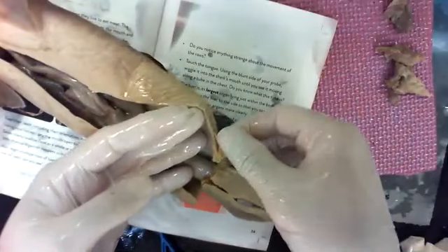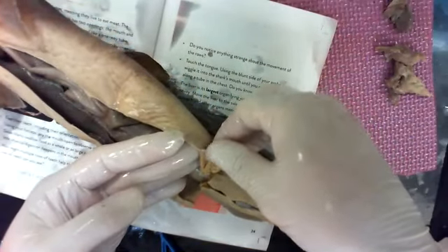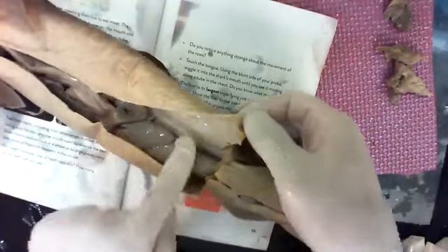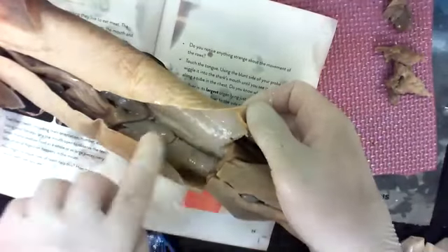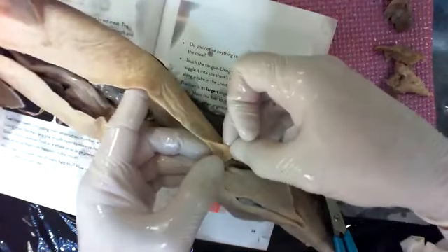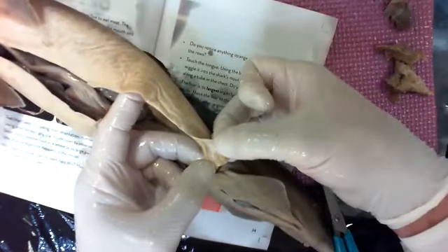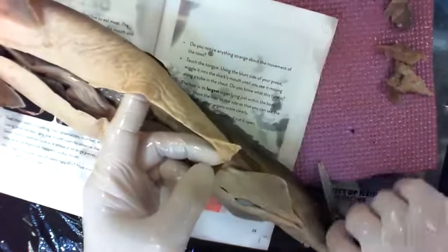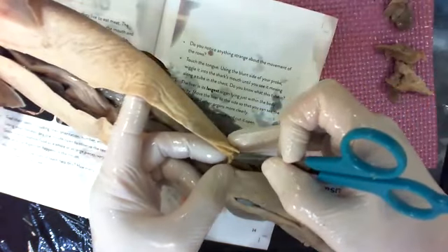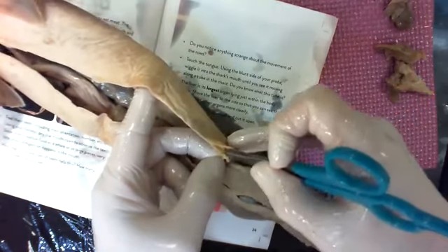When I open this up, it's kind of cool. I can see the layers. Here's the skin. Here are the layers of abdominal muscles, just like we have. The sac, the shiny part, is the sac that goes around all the internal organs. It's called the peritoneum. As I pull back, I can see the skin and all the connective tissue that holds it together. I can see the different layers of muscle. It's crazy. Here, it's kind of pulling the peritoneum off, but not completely.